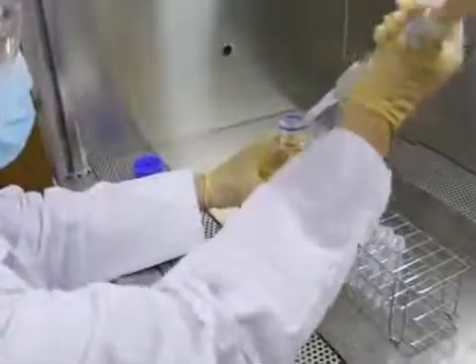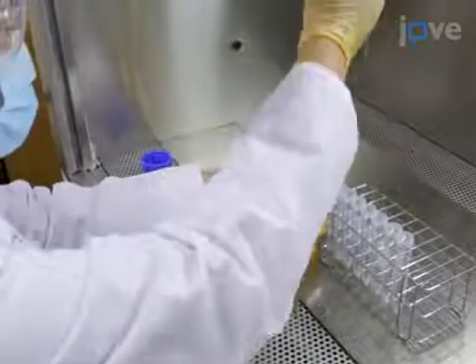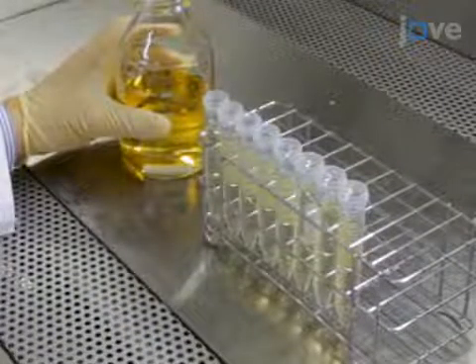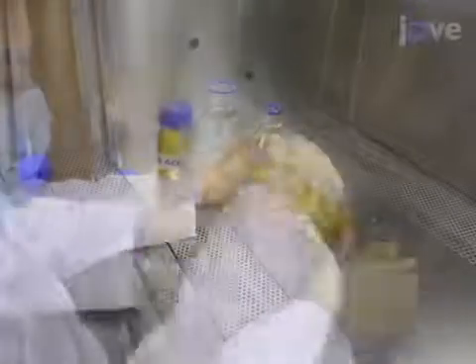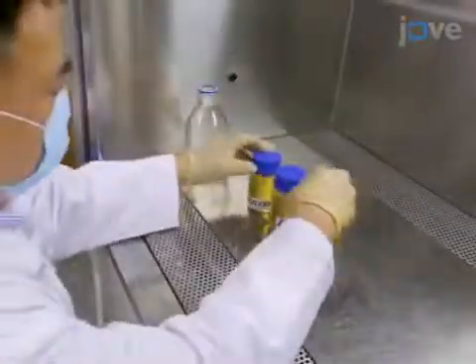Allow the solution to cool down to room temperature and then use a pipette to aliquot 12.5ml of the broth into 8 15ml centrifuge tubes. Aliquot the remaining broth into 3 100ml laboratory bottles. Cap the three bottles tightly and keep them in the biosafety cabinet.